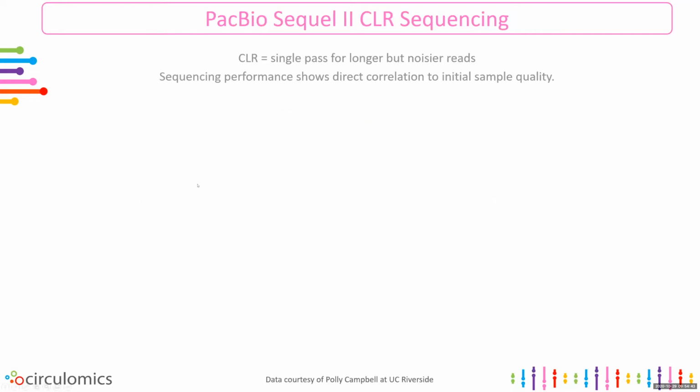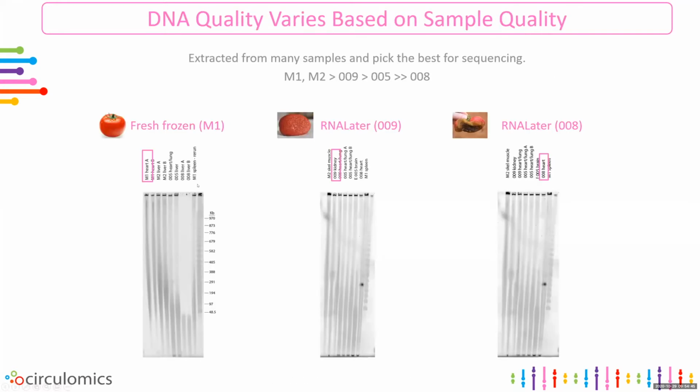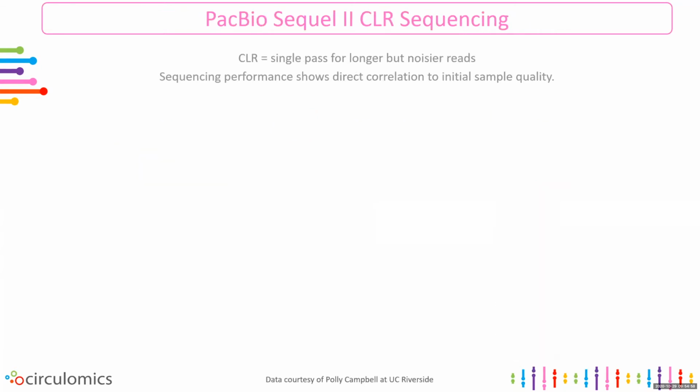So basically, we picked the three best samples, which are highlighted with these pink squares. The heart sample from the fresh frozen, the kidney from the dead individual, and the heart sample from the very dead individual. And these were sequenced on PacBio CLR. So this was before HiFi took off. And what we see is that the DNA quality, or the sequencing data performance, correlates very strongly and directly with the sample quality that was going in.